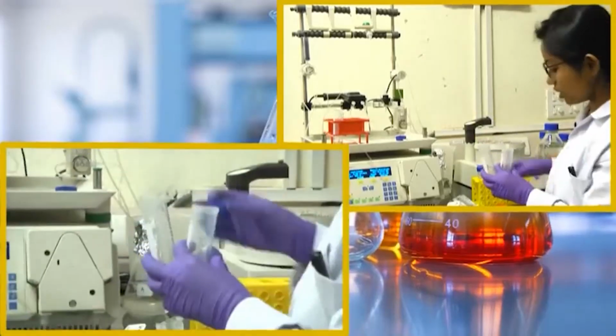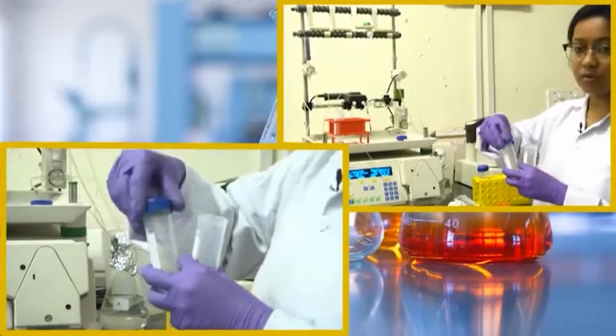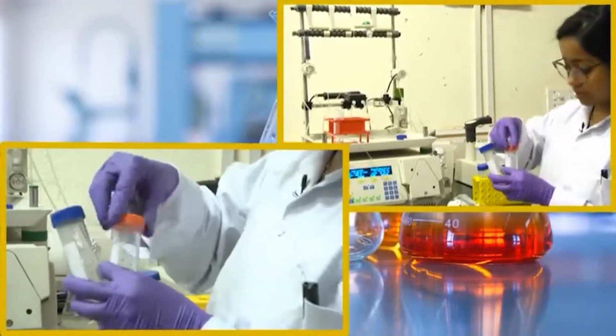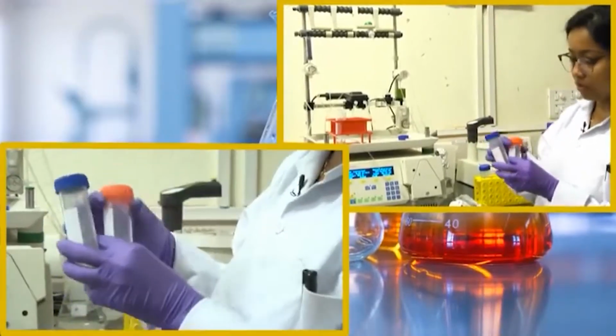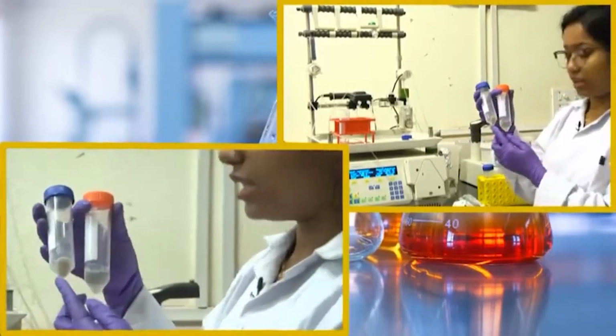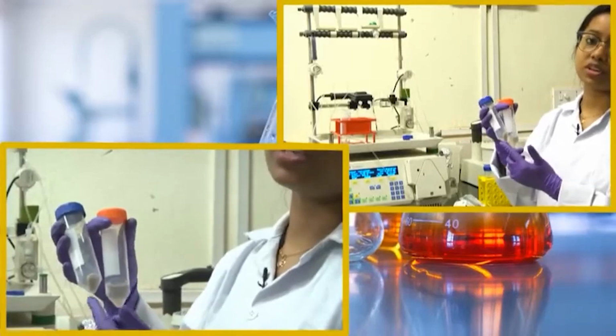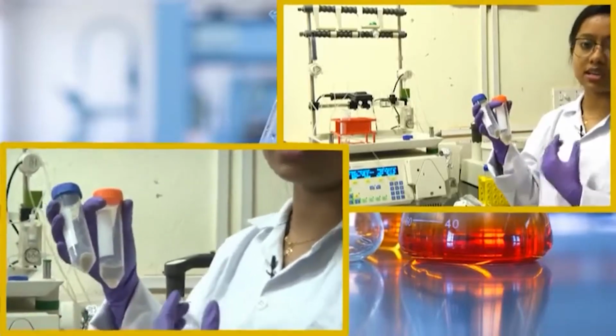At this particular stage, if you are not confident where your protein might be, sometimes in case of E. coli, due to a folding problem, your protein might be inside the insoluble pellet fraction. It means that your protein is in the inclusion bodies, it does not fold properly.